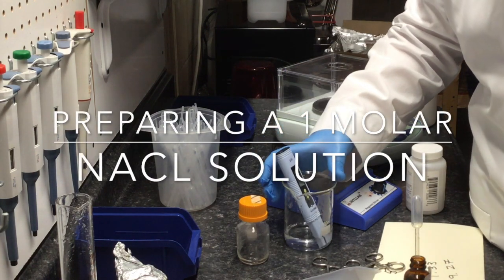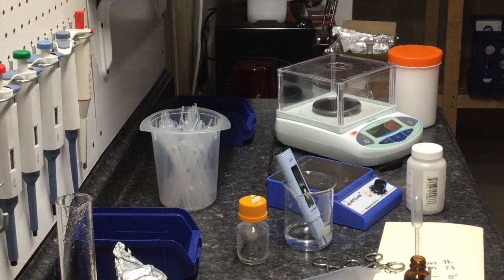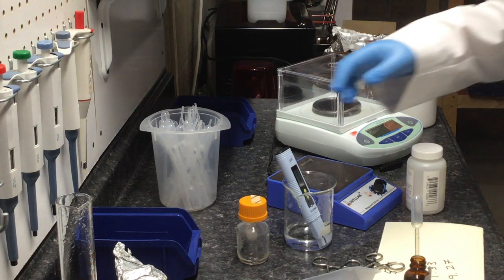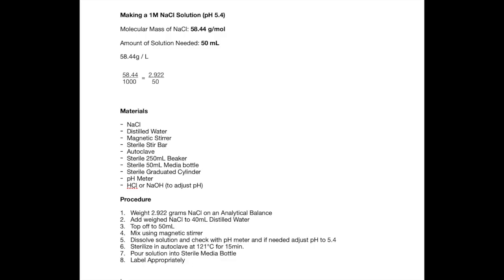In this video you will learn how to prepare a 1 molar 50 milliliter sodium chloride solution. This is the protocol I'm going to use to prepare a 1 molar sodium chloride 50 milliliter solution with a pH of 5.4.